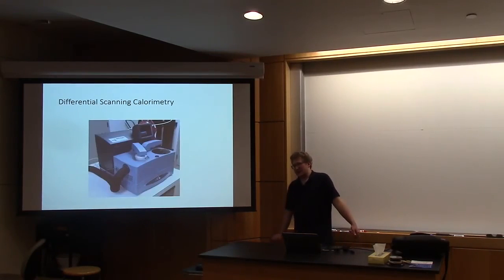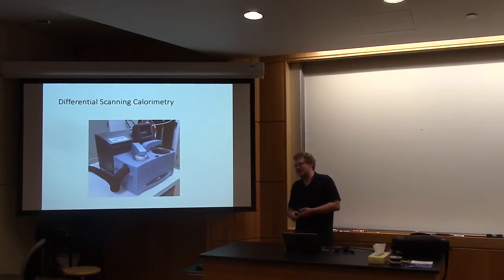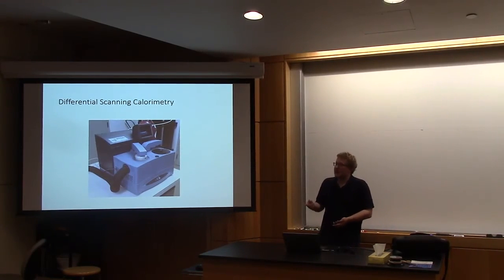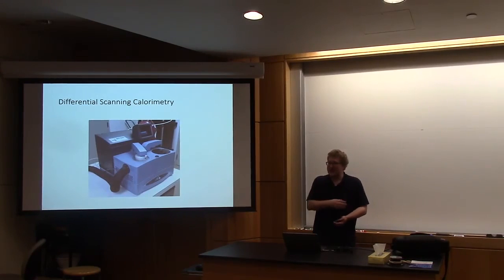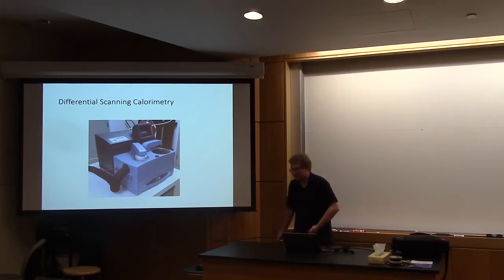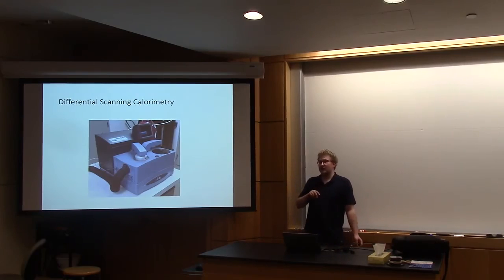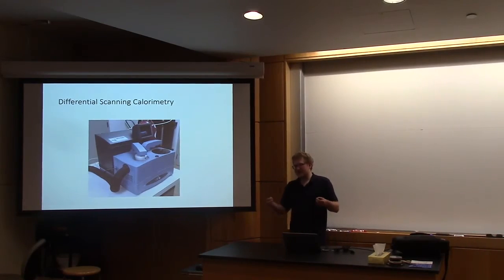Now, another thing that we can use to check out liquid crystals is differential scanning calorimetry, like I said. Basically, what this tells us is how chemicals respond to heat and what sorts of phases they have. Liquid crystals are not actually limited to one phase. They can have several different liquid crystal phases, based on the way that they are ordering themselves within a sample. So by using differential scanning calorimetry, or DSC, we can figure out where all of these melting points are. This can be incredibly helpful if we want to use our liquid crystals as, say, temperature-sensitive switches, or for industrial applications, we can use it to determine where different parts of stress or heat leakage occur.